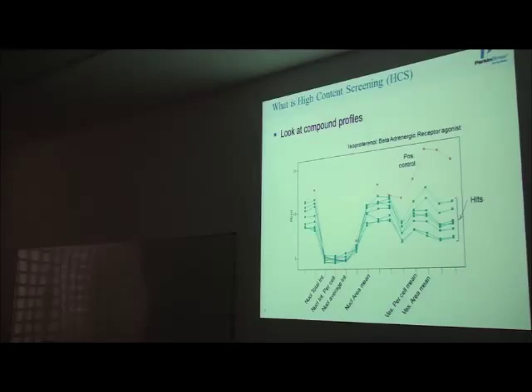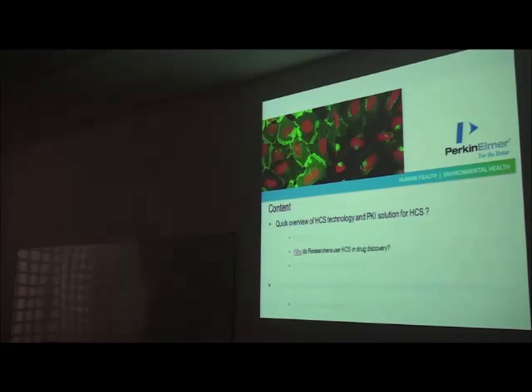That's typically when you use this technology. Instead of comparing compounds using only one point, for example one intensity, we really look at the profile. And that's the final readout. That's the main difference.